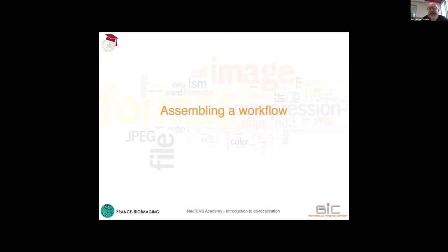But if you're willing to implement, for instance, the Pearson coefficient, I'm sure you can extend it to three dimensions, but I'm not sure that an implementation already exists. My answer would also be that it will be difficult to make it understandable by viewers after, because 2D scatter plots are already challenging sometimes. Yeah, and then if we make a 3D graph, it will be difficult.